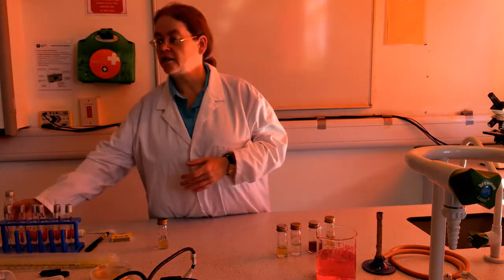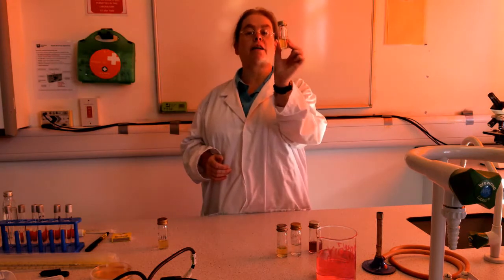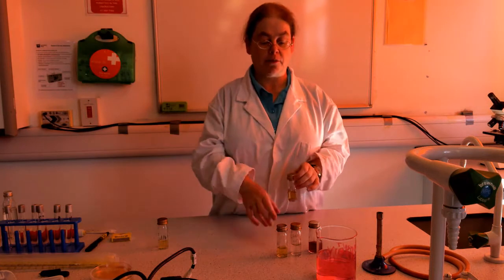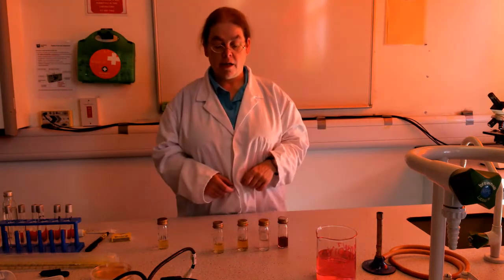Now that's been done for us, if you like. So we have here the finished results, the made-up growth media, the 4 different possible things we could grow the bacteria on.